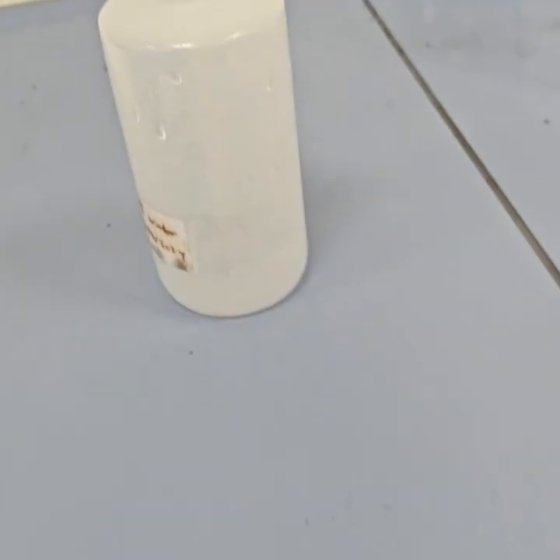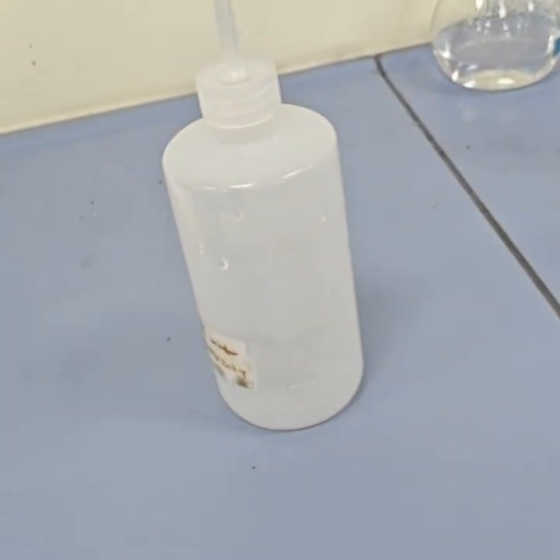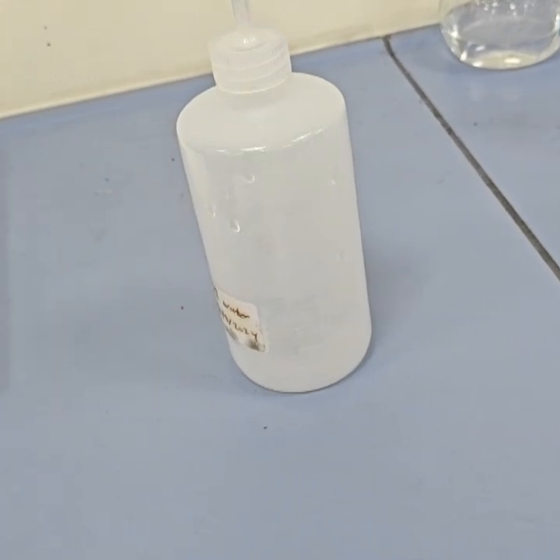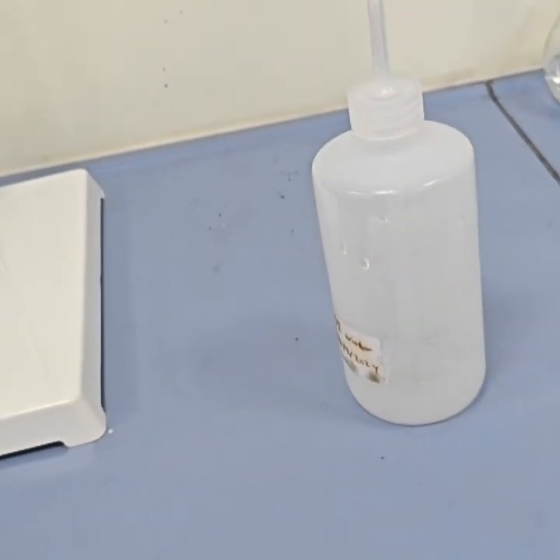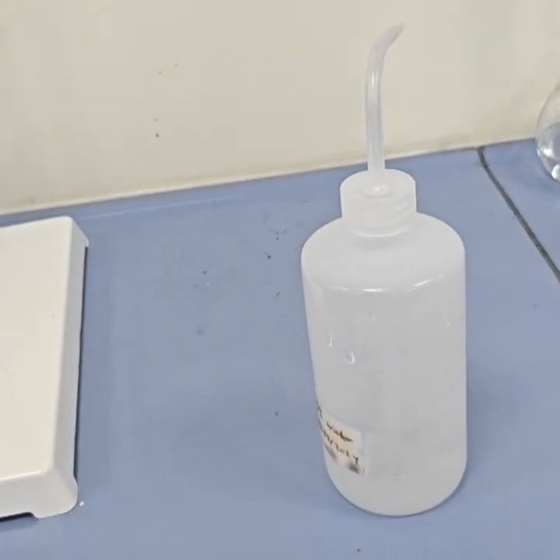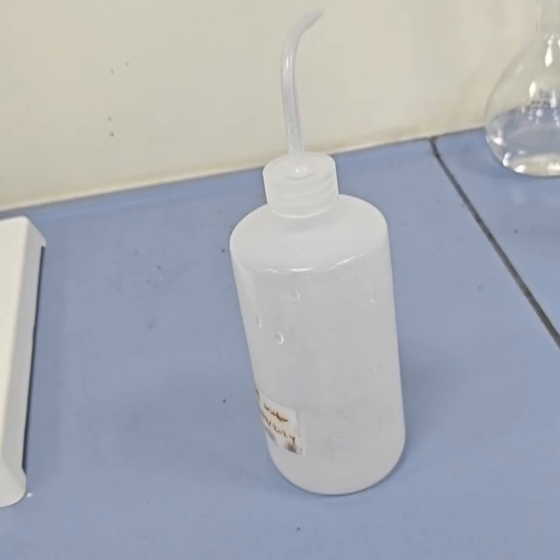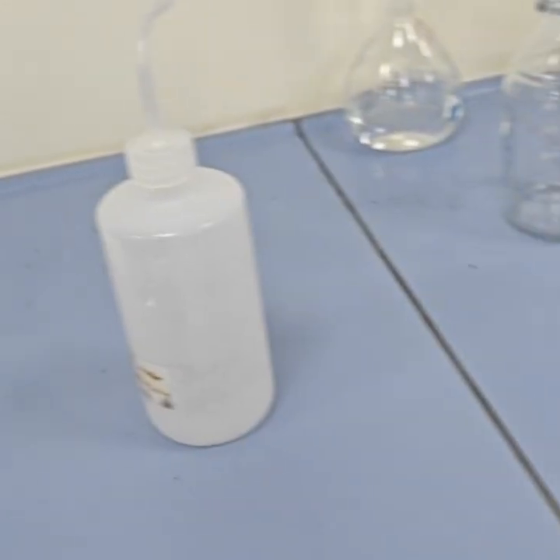Okay. Now for the BOD, you have to use a borosilicate bottle, and make sure you don't add any preservative, as I told you earlier. For COD it could be a glass or Teflon bottle. For total suspended solids, it could be a polyethylene bottle. For nutrients like nitrate, phosphate, ammonia, it could be a polyethylene bottle. Okay, and for the metals, it should be acid washed.